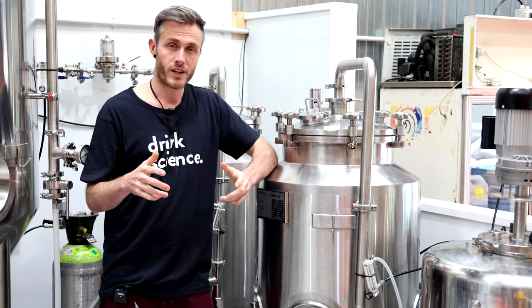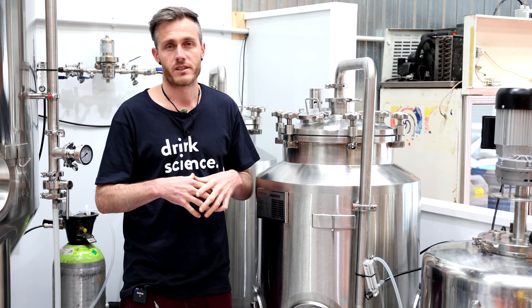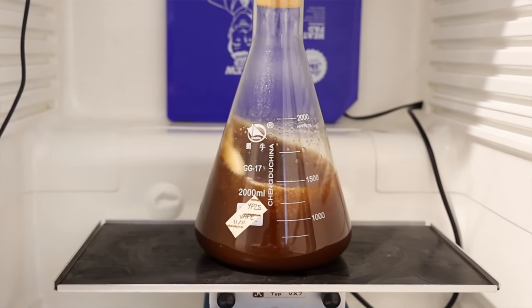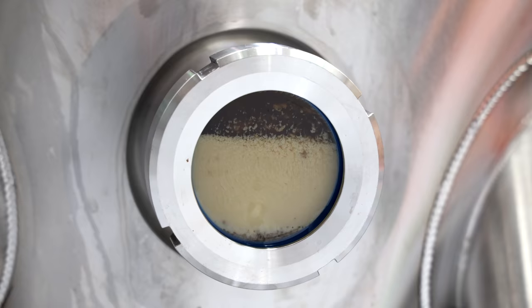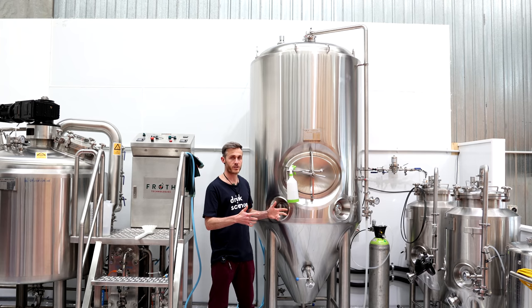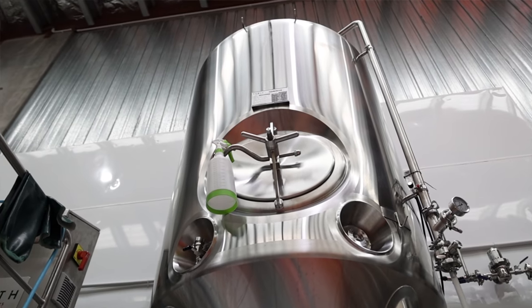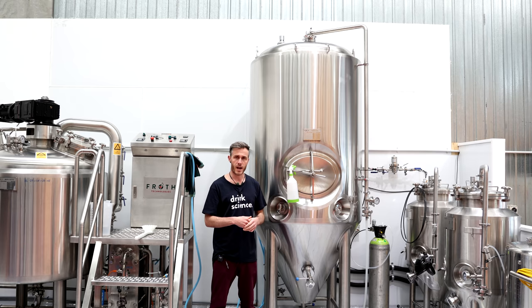From there in the laboratory — or our yeast nursery as we call it — that's where the yeast is just starting to grow up, starting to build up a smaller population at a scale you might be familiar with at a homebrew scale, with the glassware. From there, we come out here into the production area, and this is where things start to get more serious. We come into this stainless steel propagation vessel — it's 100 litres — and after the 100 litre propagation vessel, it goes up tenfold into this 1000 litre vessel. Every step of the way, right from the early stages in glassware right up into this big tank, we're monitoring the yeast health and the yeast population growth just to really know what's happening.